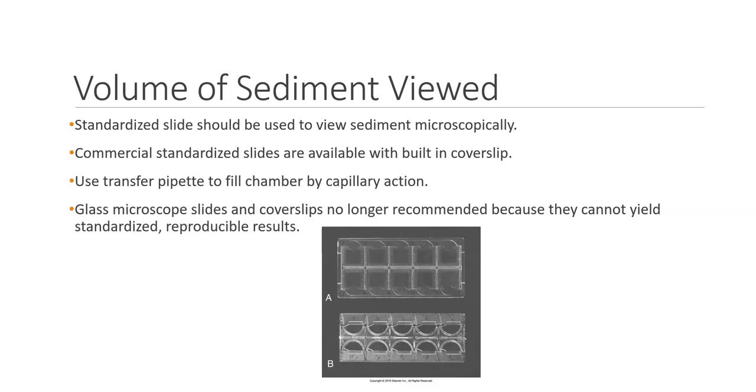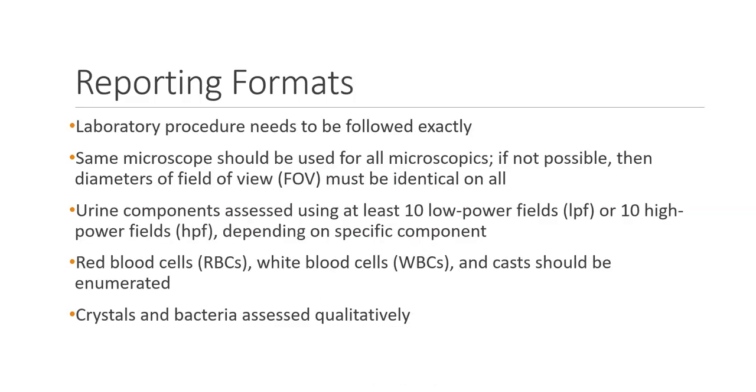Glass microscope slides and cover slips, where we dump a little bit of the sediment on there, are no longer recommended because they cannot yield standardized, reproducible results. The laboratory procedure needs to be followed exactly. The same microscope should be used for all urine microscopics. If not possible, then the diameters of the field of view must be identical on all.